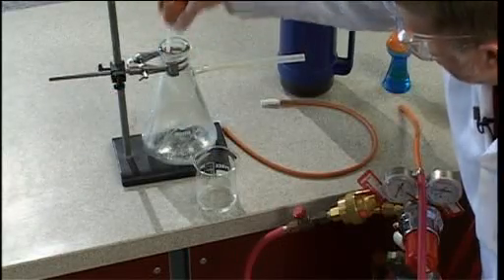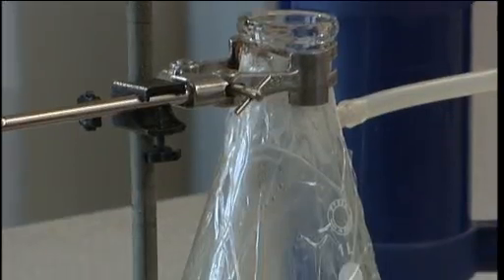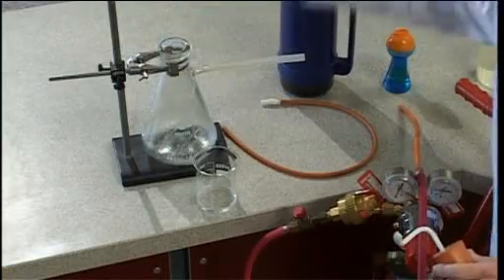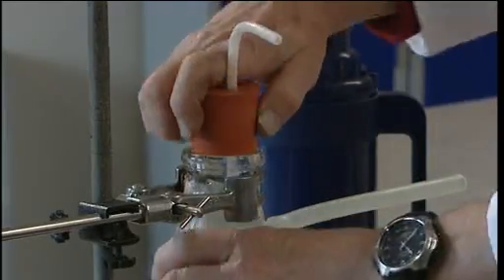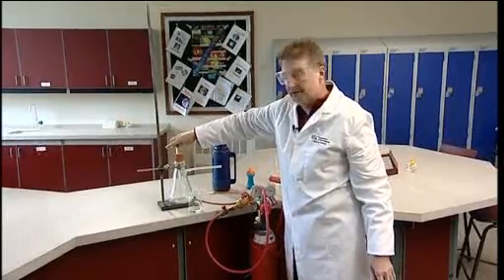This is the apparatus we use: a Buckner flask. The flask is covered in tape to prevent flying glass in the unlikely event of an explosion. We can pour in some warm water and dry ice to produce carbon dioxide, and this stopper and delivery tube can be connected to a hydrogen cylinder.